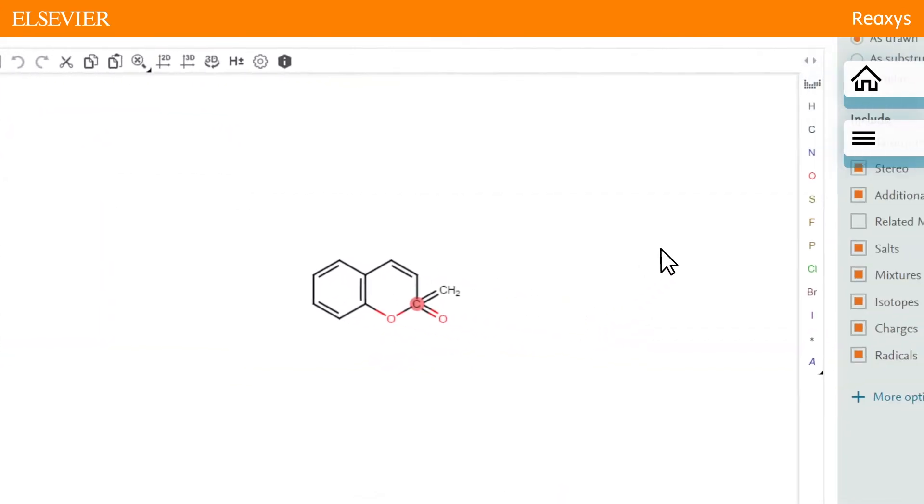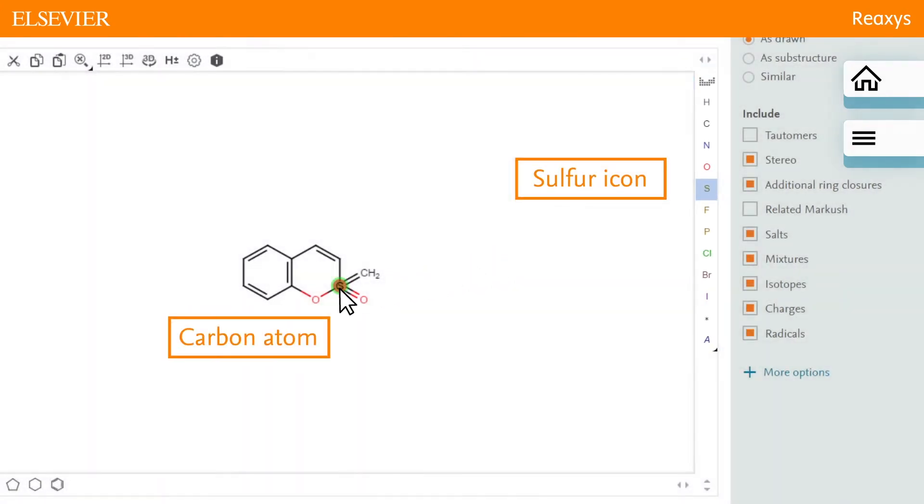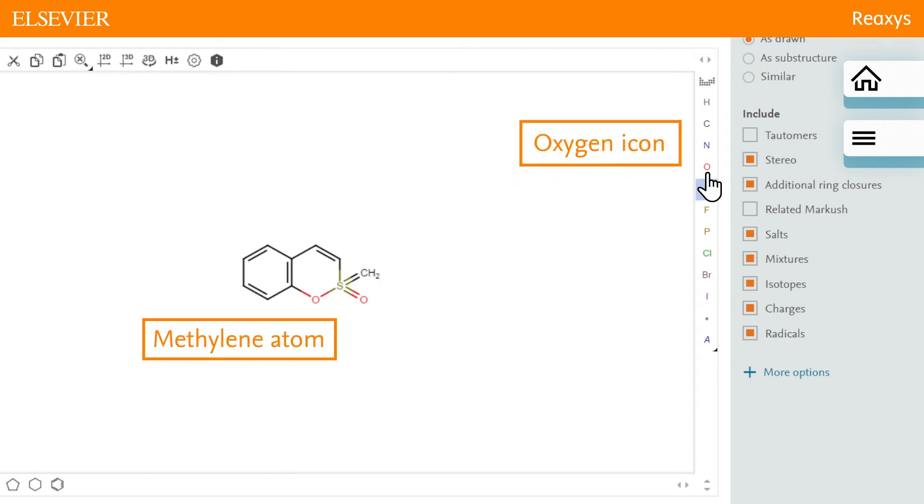Change the carbon atom to sulfur by clicking the sulfur icon, then the carbon atom. And change the methylene atom to oxygen.